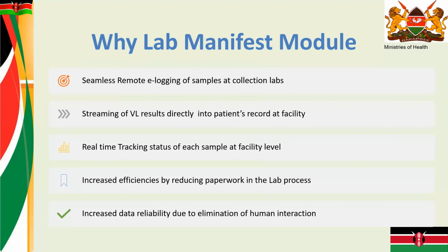So why is it important? Why do we need to use the Lab Manifest module? As I've stated, one is to achieve seamless remote logging of samples at the collection labs. We can use this technology to create a sample manifest, and then electronically submit that to the testing lab.